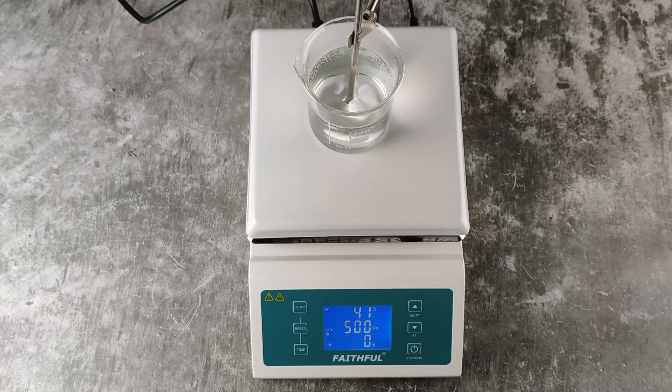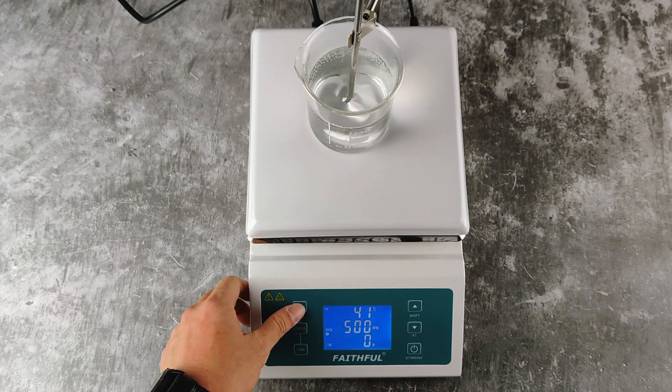How to set the temperature. Currently we can see we are using the external sensor because the A is shown here. PV means the current temperature reading, so it's reading at 41 degrees. To set the temperature, you press the temp button.